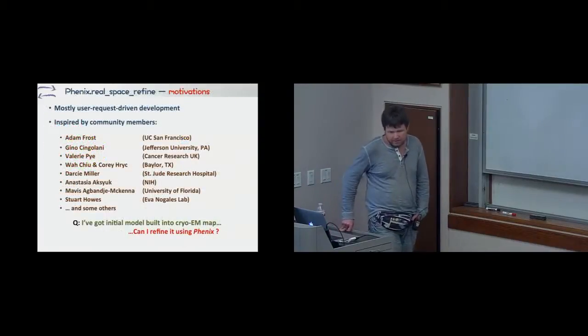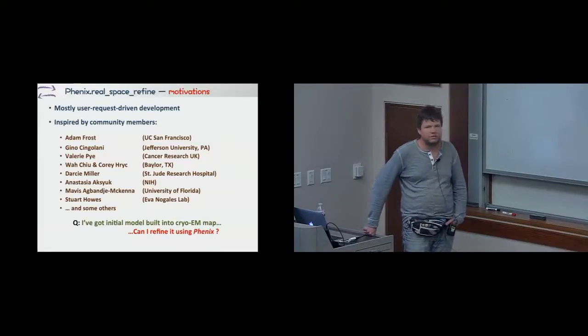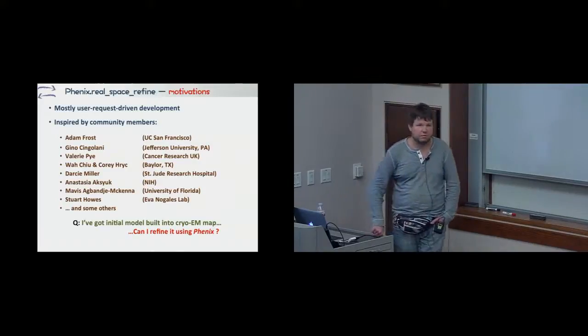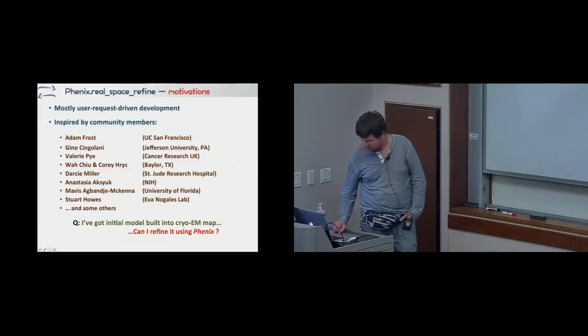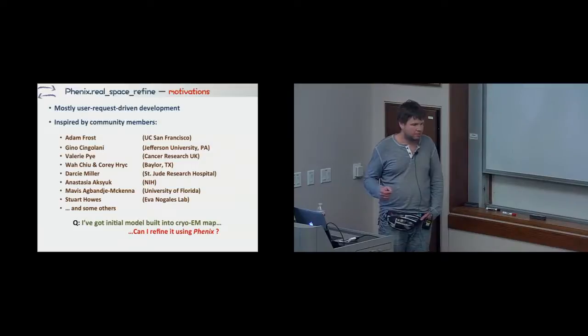Basically, the development of these tools is kind of user request driven development. Back in 2013, I didn't really plan to work on this that closely. But then people started coming to me and saying, "Oh, I've got a cryo-EM map and model. Can we refine it in Phenix?" That's a very typical question that I got, people asking over and over the same question. And the answer was, well, kind of.